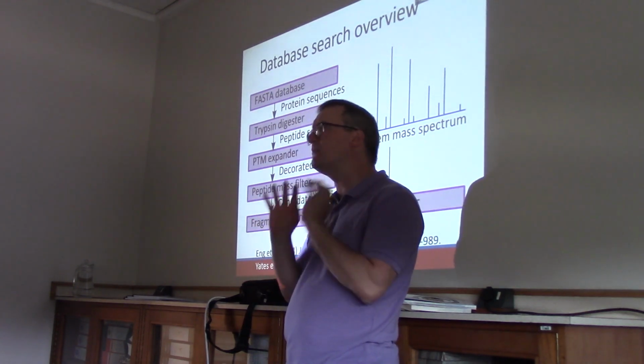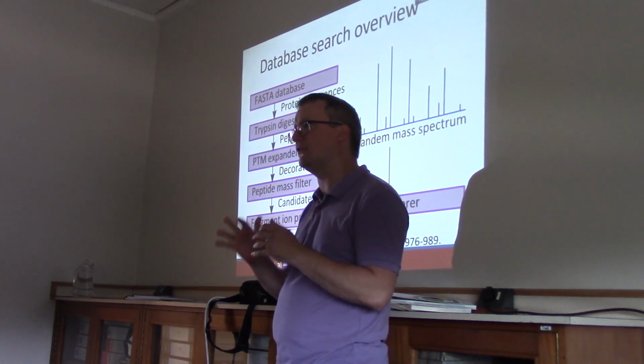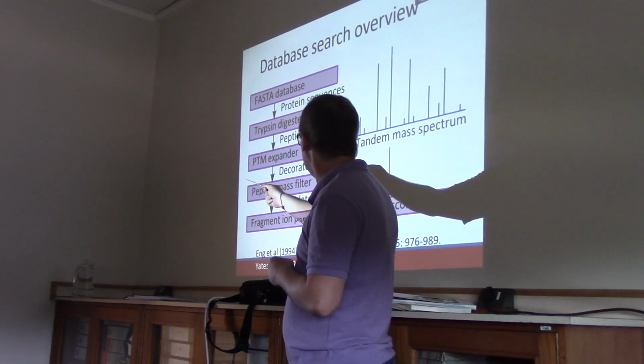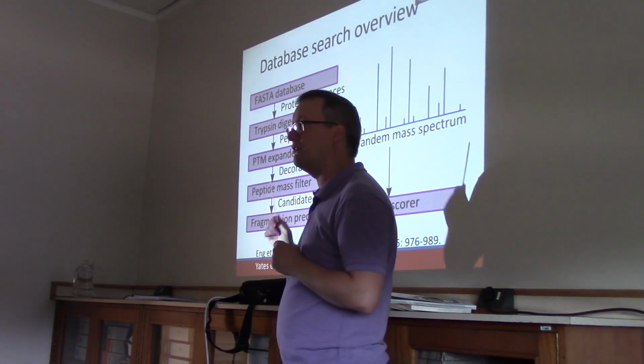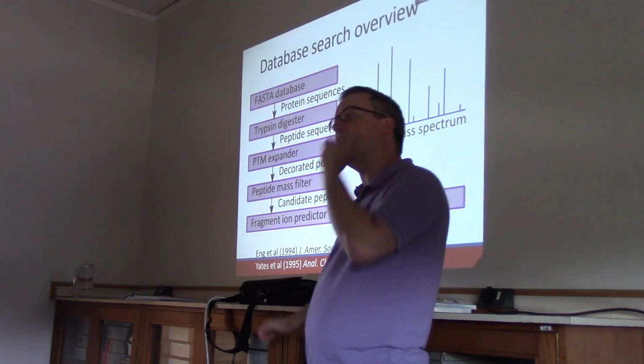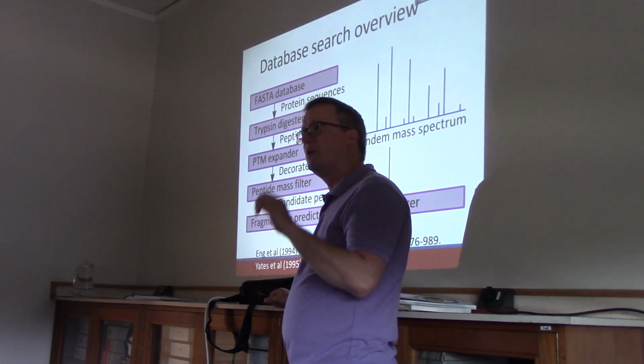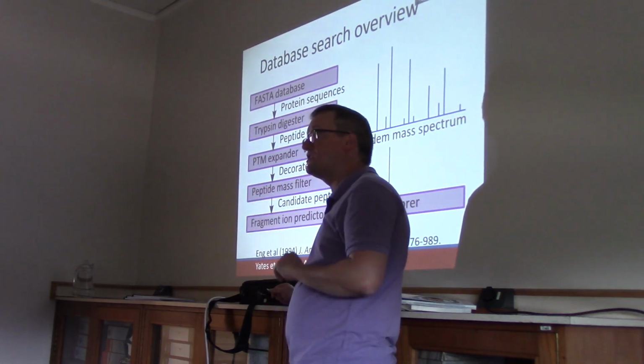A very, very important feature, really the reason why Sequest was able to work in the first place, is that we don't need to compare every decorated peptide to every tandem mass spectrum. What information did we collect about each tandem mass spectrum beyond the list of fragments present in it?